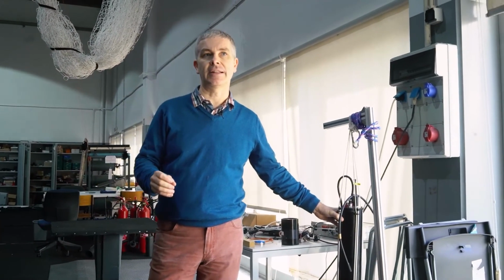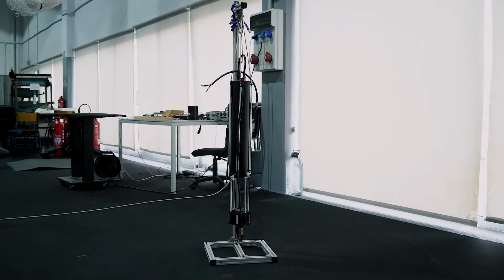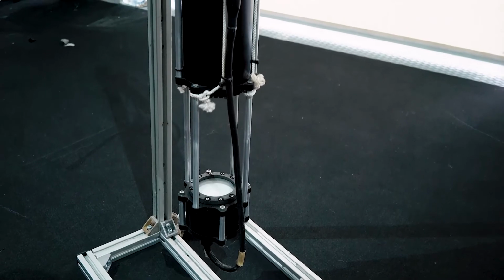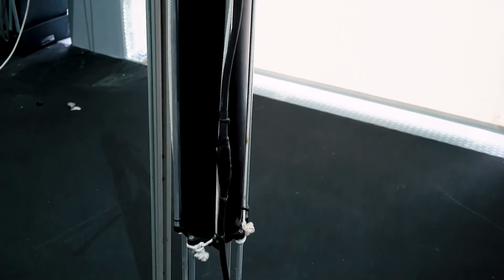We also develop specific sensors for use in robotic systems, which is, for instance, the case of this camera for filming plankton and classifying plankton in the marine environment. This is a microscopic camera that takes images of plankton and classifies in real time the plankton detected in the images.